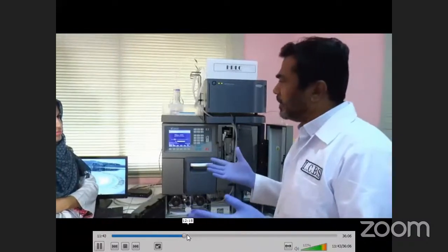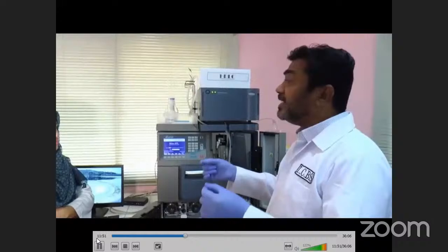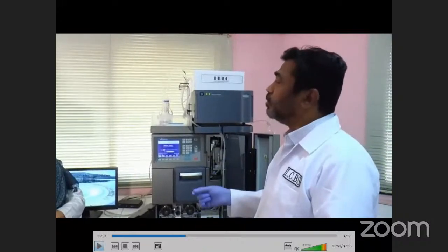And click finish. As it is preparing the standard solution, you need a very good analytical balance, and analytical skill is more important.